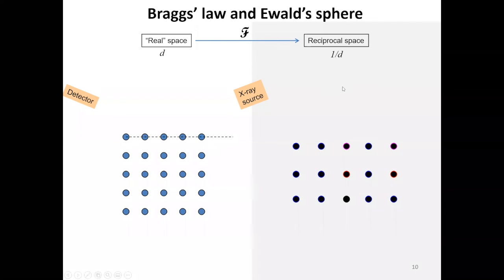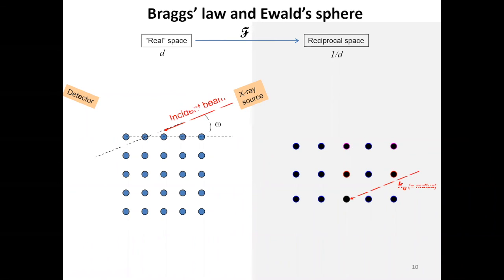The diffraction process is described by the difference between these two wave vectors, which is called the scattering vector. If you assume, as in diffraction, an energy conservation process, the absolute values of these two wave vectors are the same. Then, with the angular notation that you have here, you come down to this relationship due to both father and son Bragg, the famous Bragg's law.